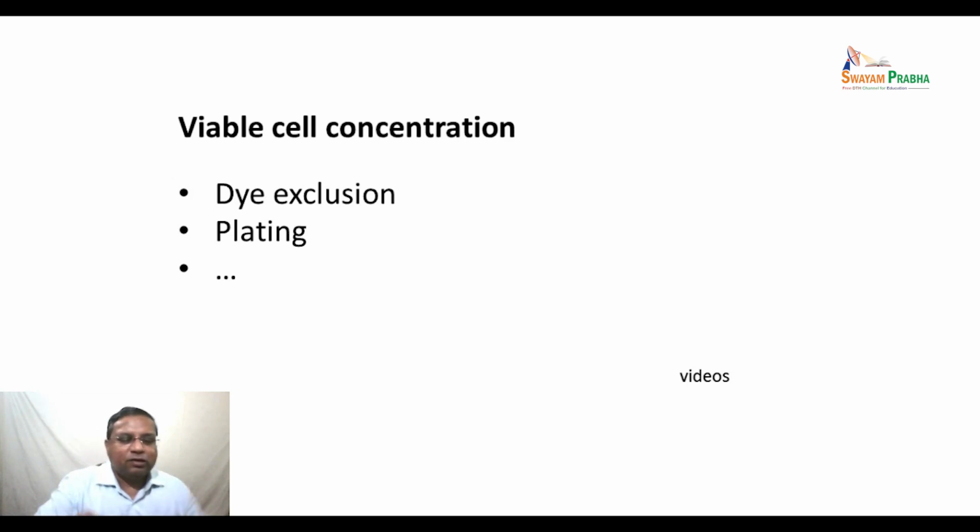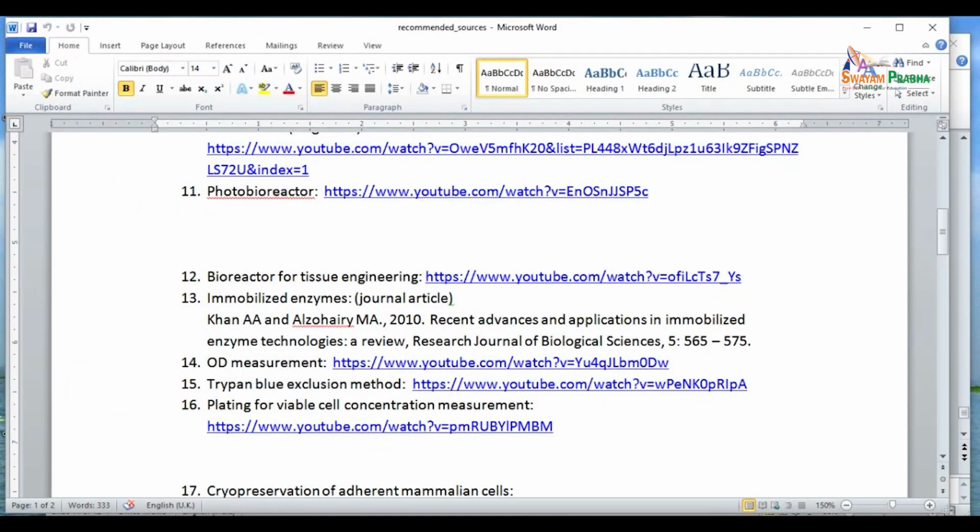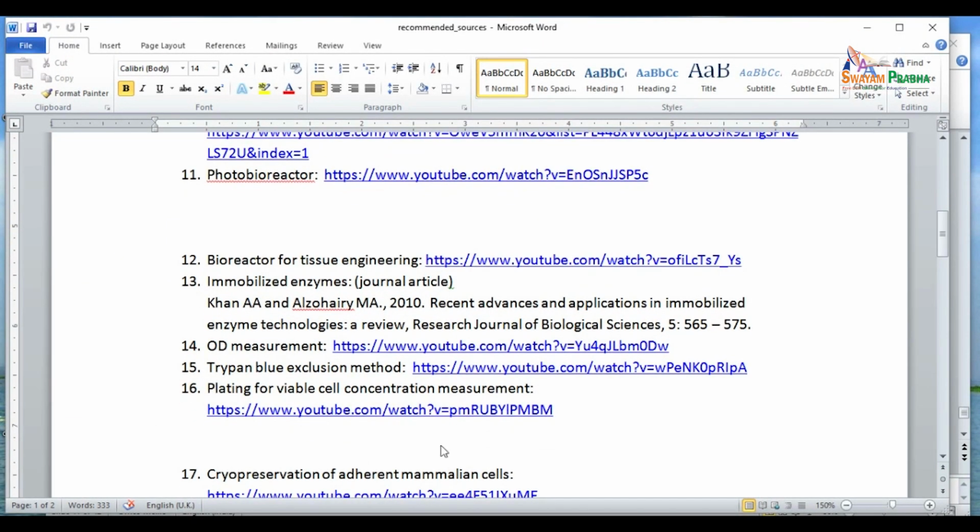The videos here, let me show you the details of the videos. You may want to look at them. Number 15 is for the trypan blue exclusion method and 16 for plating for viable cell concentration measurement. These are nice videos that you can look at for the details of the measurement.